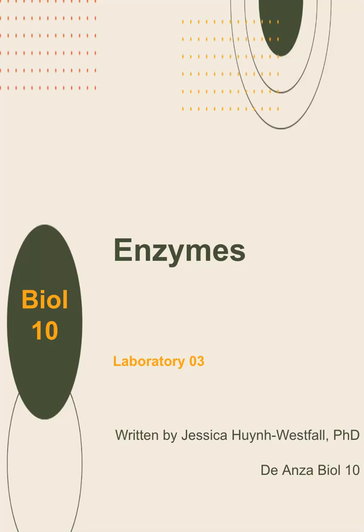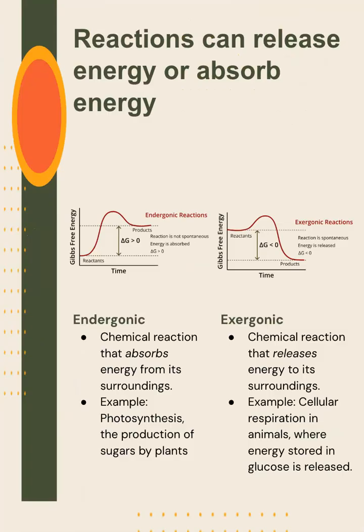Today's lab is going to cover enzymes. Recall that enzymes are proteins, and these proteins are able to catalyze reactions. So first, let's look at the types of reactions that exist. There are two types of reactions that we're going to look at.